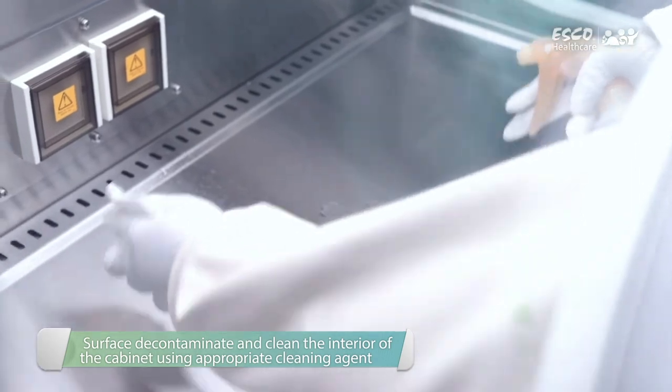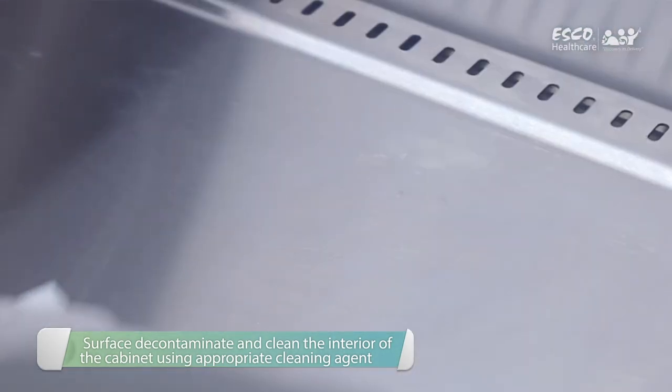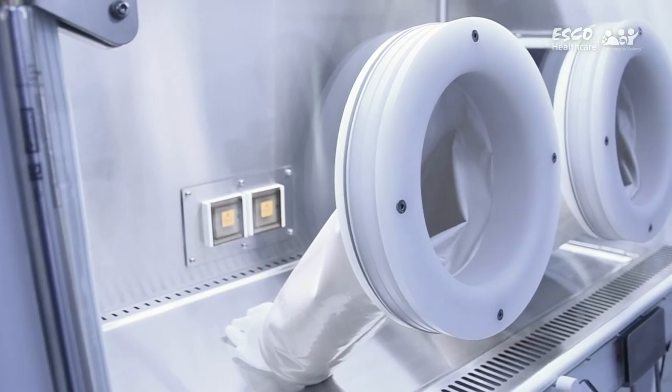After the warm-up procedure, start surface decontamination and cleaning as per the institution's SOPs and local guidelines. You may now use the IsoClean Healthcare Platform Isolator.